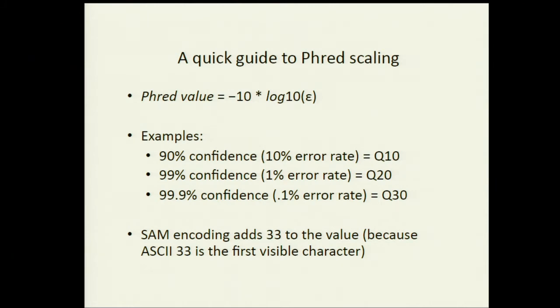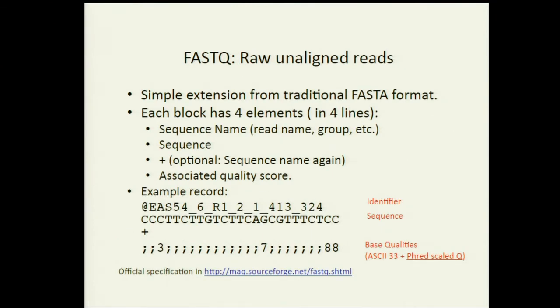That's probably more confident than you can actually be with next generation sequencing. So if you start to see Q scores in your bases saying the machine is Q50 confident in its base, you just can't really believe that. Downstream, Ryan and Guillermo will talk about our SNP calls, and there'll be a confidence there, which is also Phred scaled, and will be like Q a million. Those are not accurately represented, we'll say. So don't be afraid if you see those. And we talked about here, in this BAM, we have these numbers. They're ASCII 33 plus the Q score.